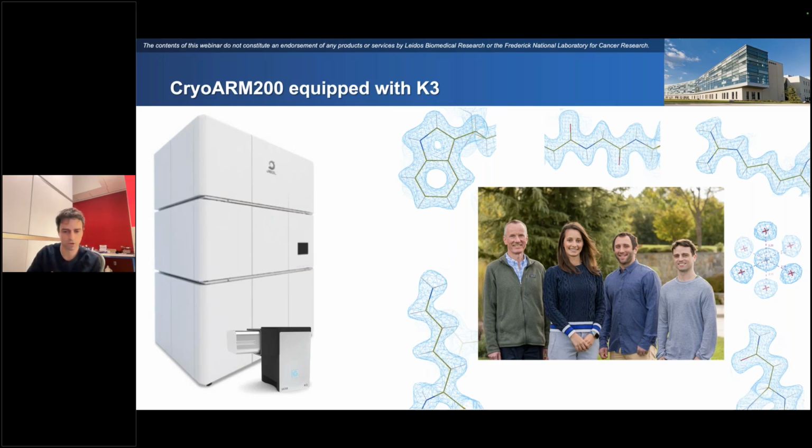It was the first JEOL microscope that had this multi-specimen cryo holder. Shriram liked that, but the big thing that Shriram really liked was the fact that this was the first cryo microscope where you could have a cold FEG. And Shriram thought that the technical challenges of using the cold FEG during data collection, the flashing and all that kind of thing, were worked out enough that the potential theoretical benefits of the cold FEG could actually be shown to have a practical benefit if we were able to get this microscope in and do a good job with it.